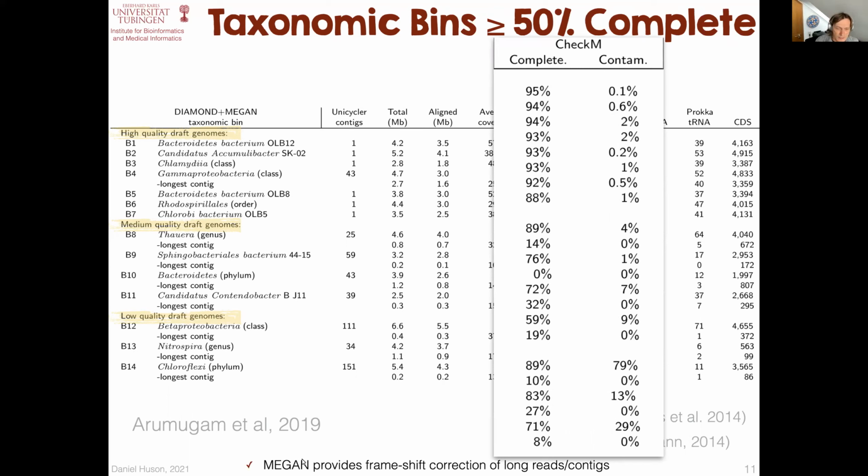One thing, if you analyze long read data and you try to run something like CheckM or Prokka on your long read data, you've probably been disappointed because those tools do not work out of the box. Nanopore sequencing puts frame shift errors, insertions and deletions, into the sequences that will break frames when you're using a translated blast. So you have to use something like a frame shift aware alignment like Diamond provides.